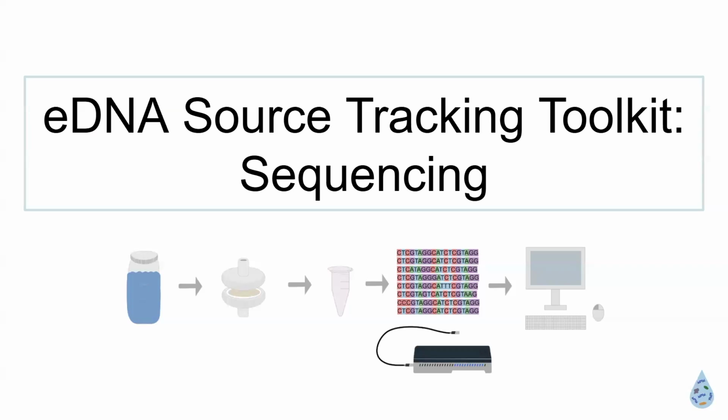If it's a site that you can't reach, like if you're over a bridge, there are horizontal water samplers that you can use. I'll describe what is in my head: it's a tube with openings on both ends, on a string. You put it in the water and drop a weight down and it snaps both sides shut. Then you can pull up a water sample and fill up your container. And again, you want to flush it out with the sample water a few times before actually filling it. But that's how I would do something that's easily accessible and something that's a little further.